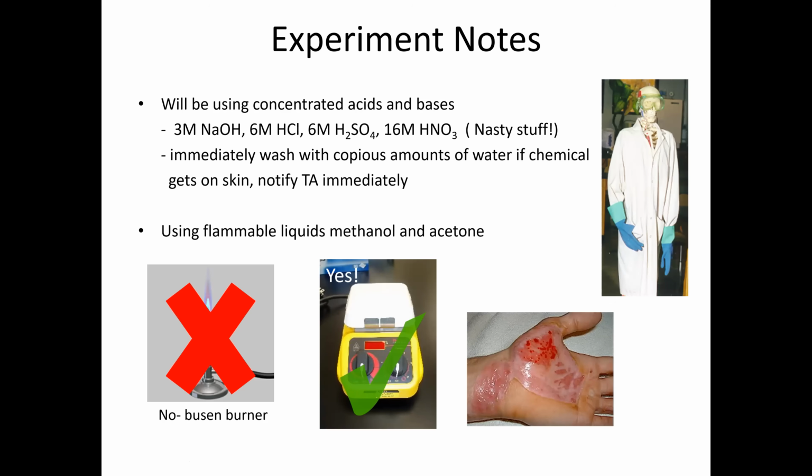Like 16 molar HNO3 is a very, very strong acid. 6 molar H2SO4. These are very hazardous reactants. So if you do spill these on your hands, immediately wash off with copious amounts of water. Also, it's highly recommended that you wear gloves as well.